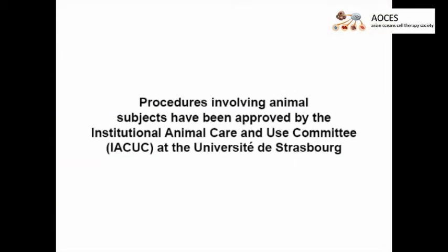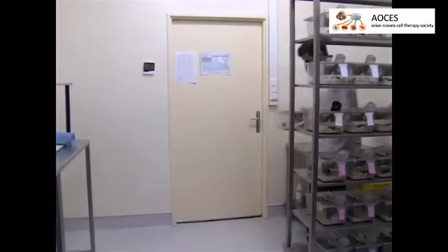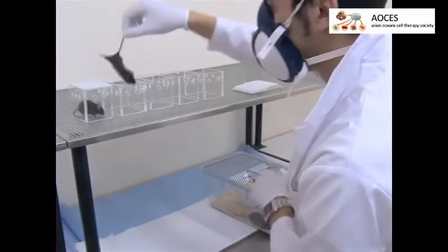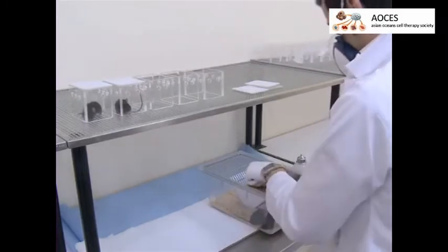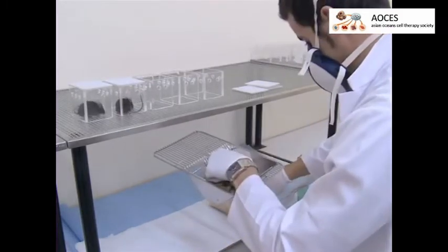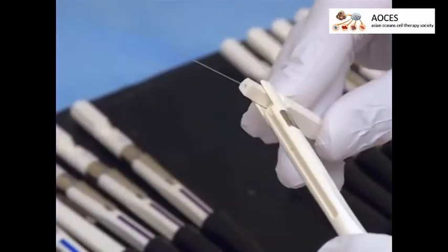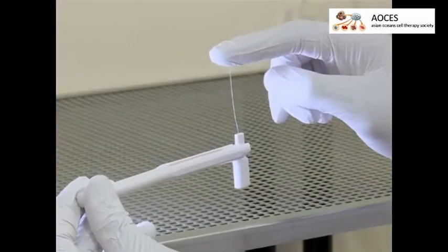Visual demonstration of this method is critical, as implantation of the cuff is a difficult step to explain without visual support. To evaluate the mechanical paw withdrawal threshold, first place the mice for habituation into clear individual boxes on a perforated steel plate. Up to 12 animals can be tested in parallel.